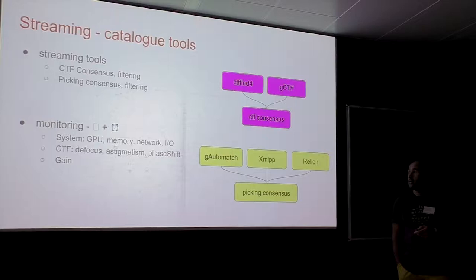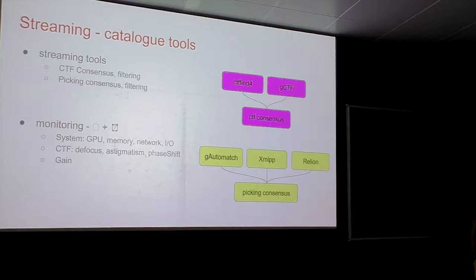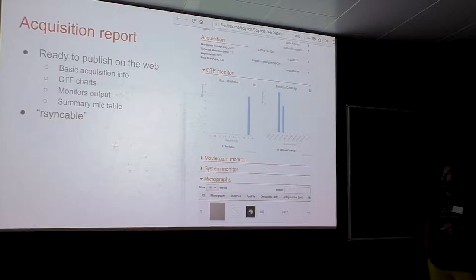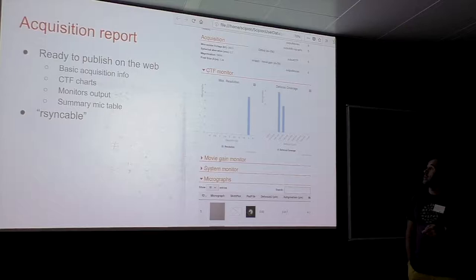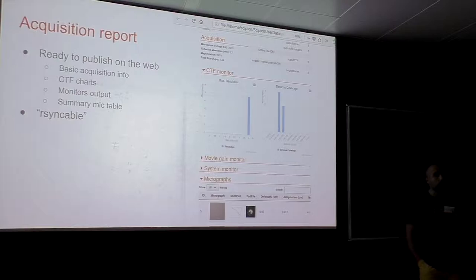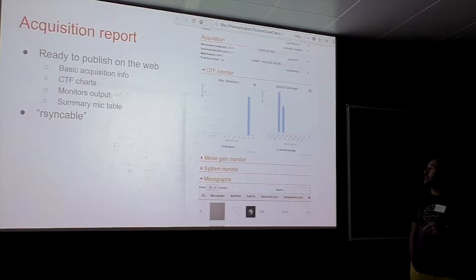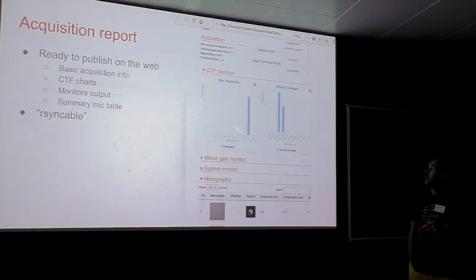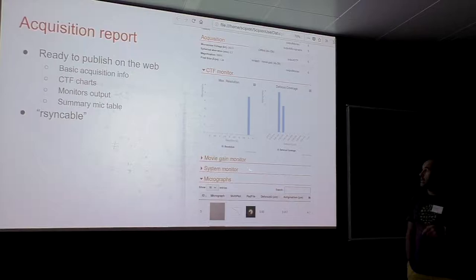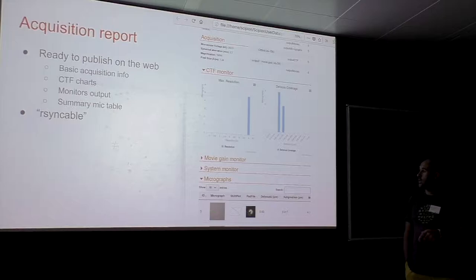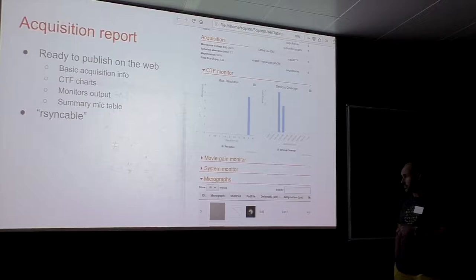The report also includes movie gain charts, system monitor charts, and a micrograph table with thumbnails of the micrographs, the shift plot, and all the values associated with the CTF. So you can monitor the CTF focus going above some value and get alerts.